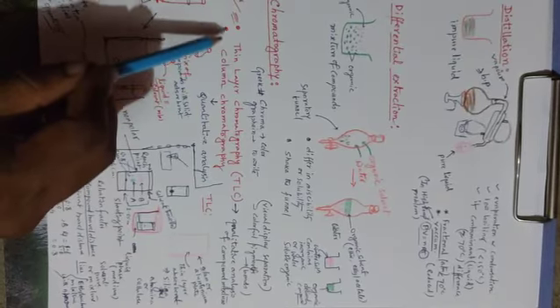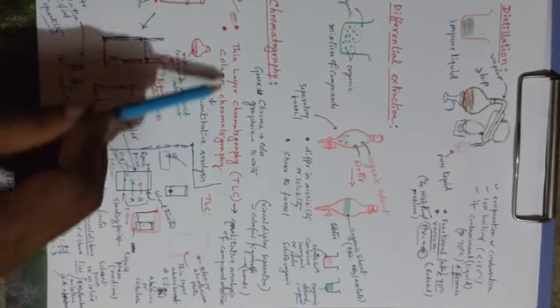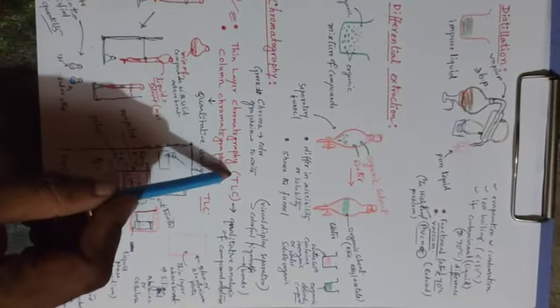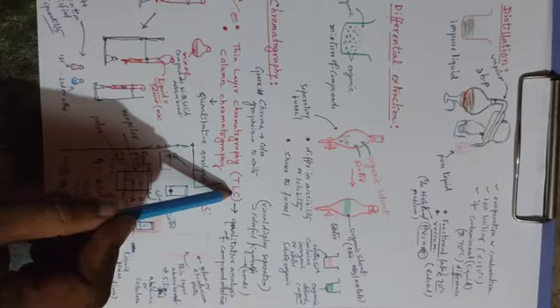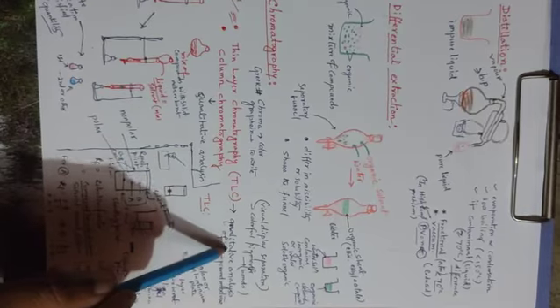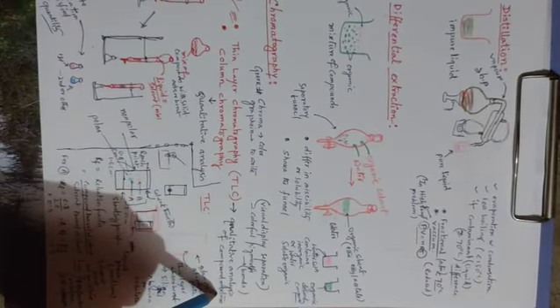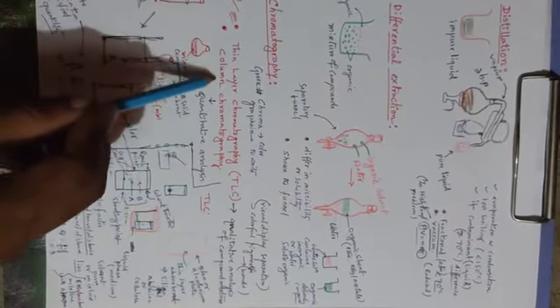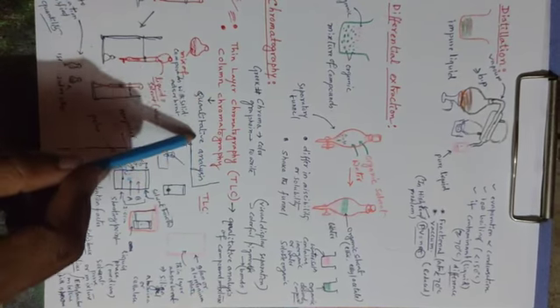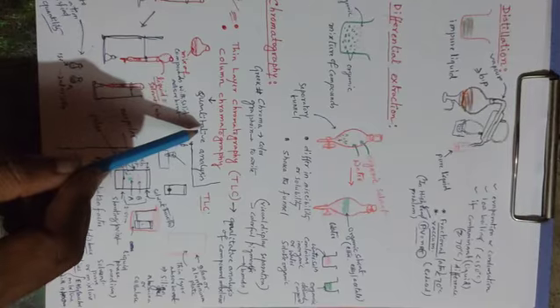Generally there are a number of chromatographic methods. Mainly we will discuss the two important types of chromatography. One is thin layer chromatography, called TLC, and it's very important in organic synthesis, as it is useful for qualitative analysis of an organic compound mixture. And another is column chromatography, which is generally used for quantitative estimation or quantitative analysis of our organic compound mixture.